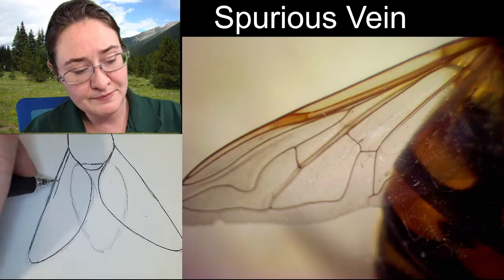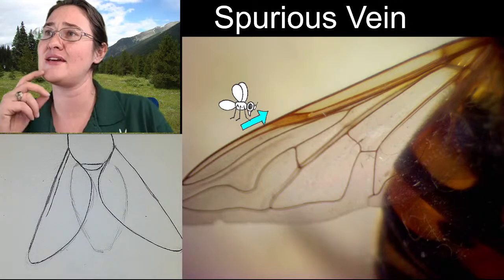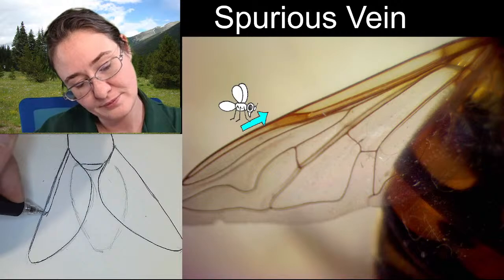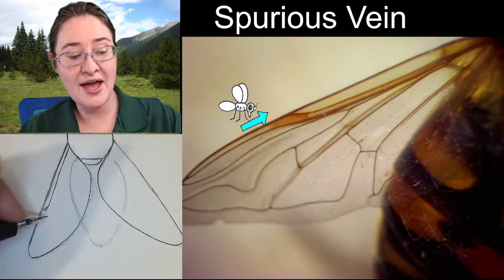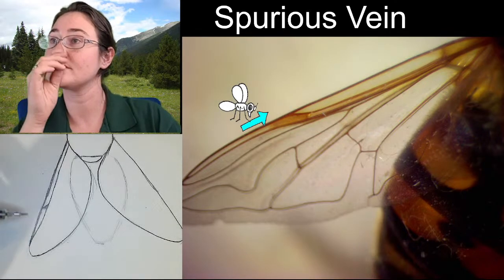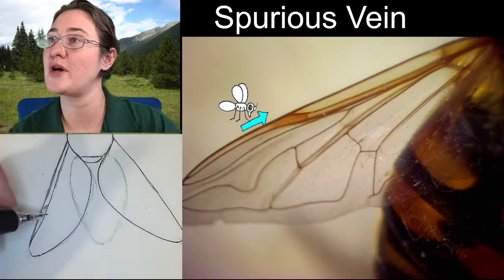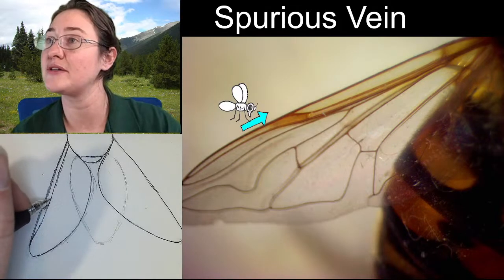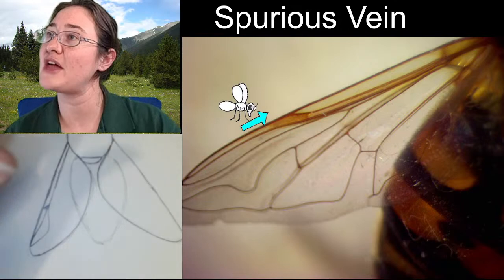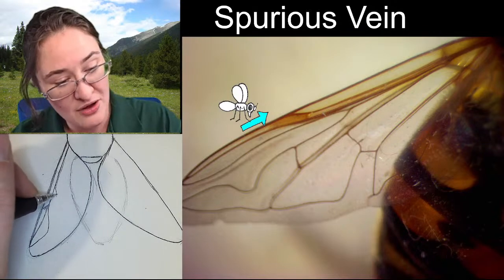And then a lot of times when we see a darker spot like this on the wing, that's what we're going to call the stigma. And the subcosta does come and meet the costa here at the end. We have one more vein that comes off of this one, right around here at the stigma. It comes around and loops down. Then we have one more, and it starts a little higher up, and it's going to arch down to around the stigma.